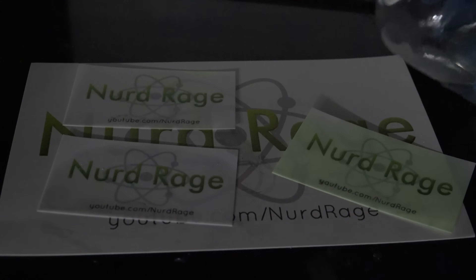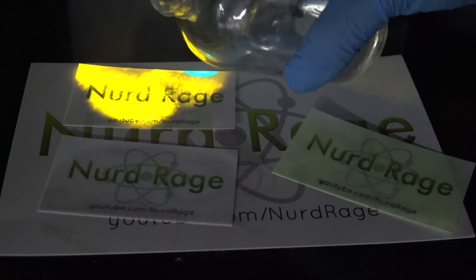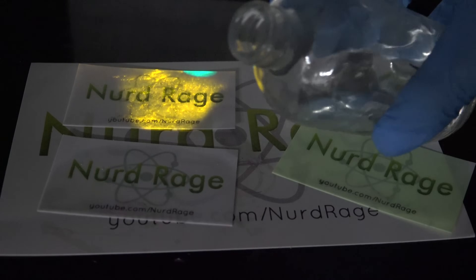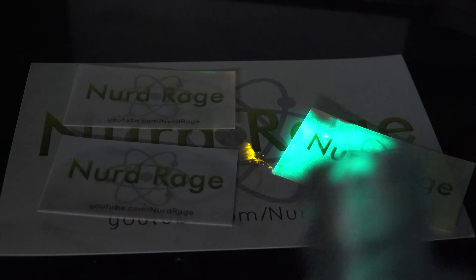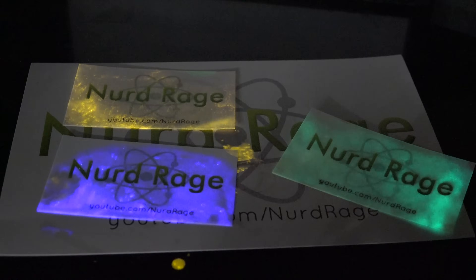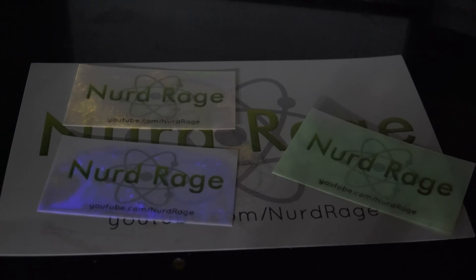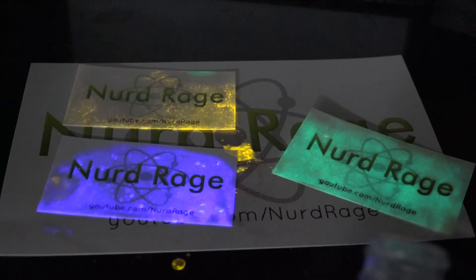Here are all the cards I've made — let's see if we can get them all to glow. I'm trying to pour the vapor onto the cards. Looks like I got some cross-contamination since the chemicals smeared onto my glove — we have some green on the yellow card and a few spots of yellow on the blue card. Let me see if I can hit the airstream of my fume hood and get the vapors to cover all the cards. And there you have it: vapor-activated chemiluminescence.